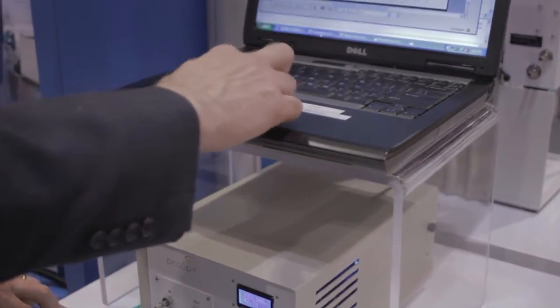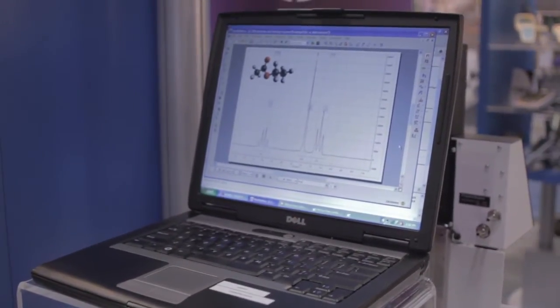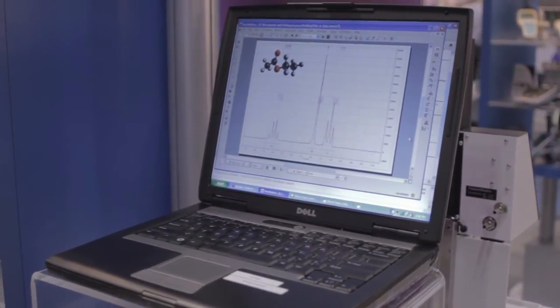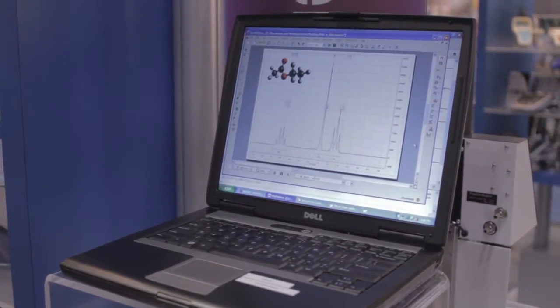And you can open it up in an NMR data analysis package. And if you open it up it'll look something like this. This is MNOVA from Mestra Labs Research. It's a standard NMR data analysis package.